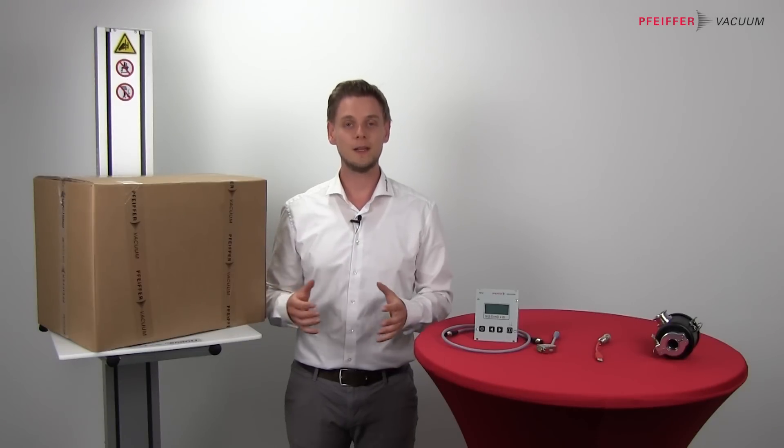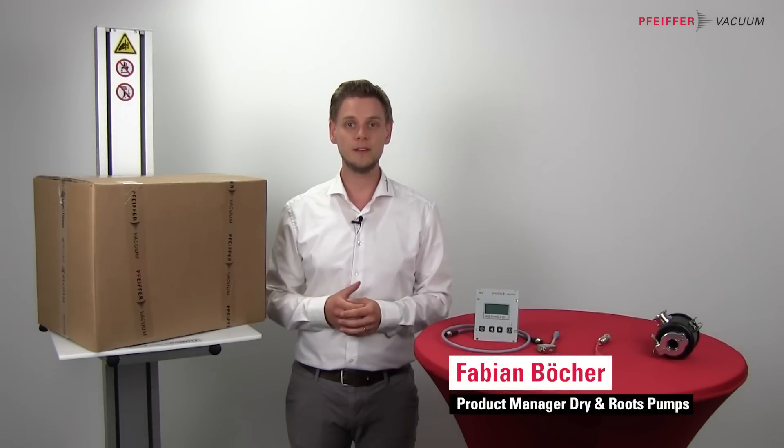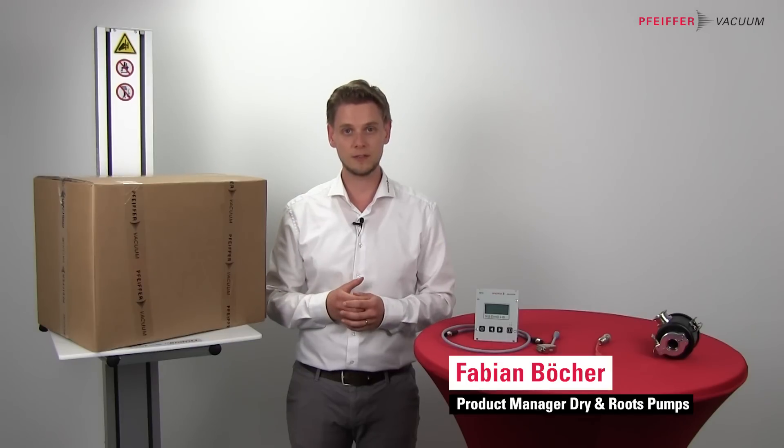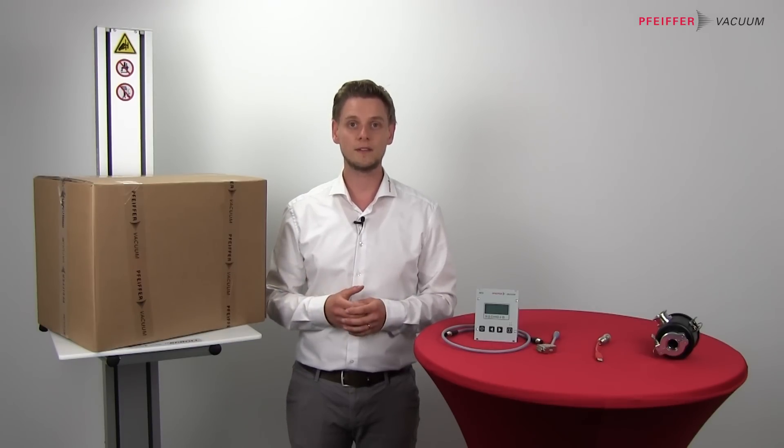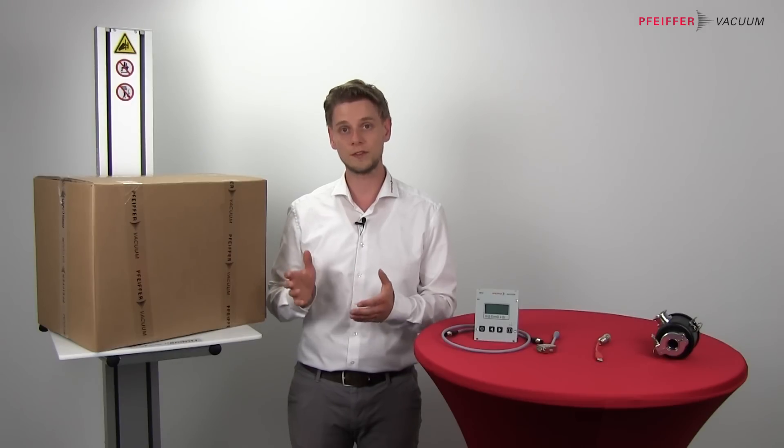Welcome back to Pfeiffer Vacuum. My name is Fabian and in the last few weeks I showed you a lot of the benefits of the brand new Pfeiffer Vacuum HiScroll. Many of you asked us about the scope of delivery of the pump, so we decided to continue this video series and show you what's inside.